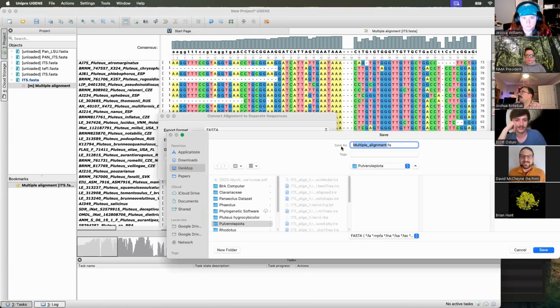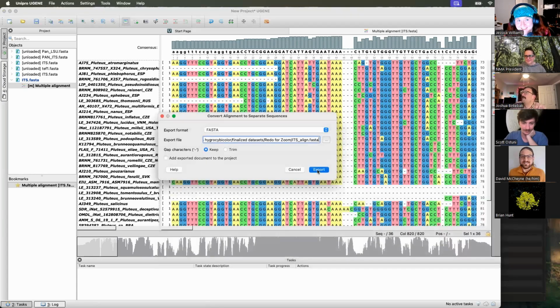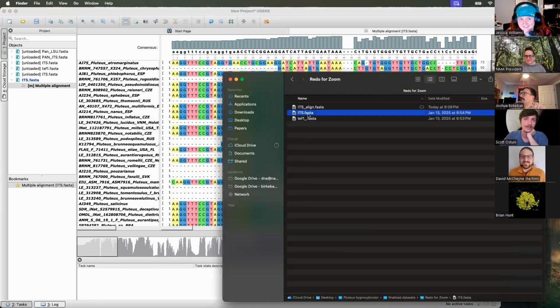Now we're going to go here and we're going to change to this folder. Please don't pay attention to my folder management skills or lack thereof. You should see my computer. It's chaos. Okay. Well, maybe I shouldn't be so hard on myself, but I always feel like it's a mess.